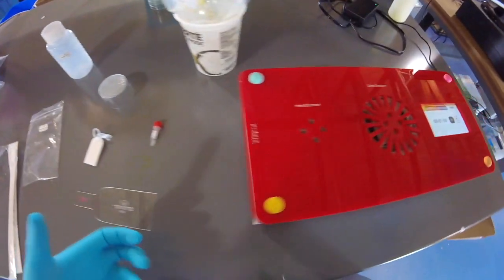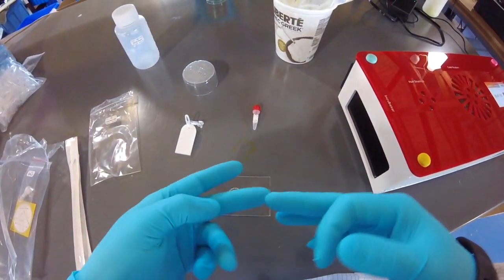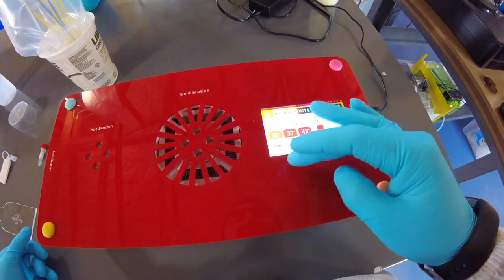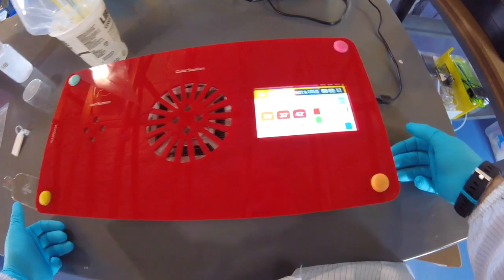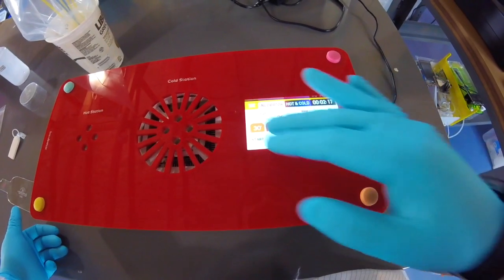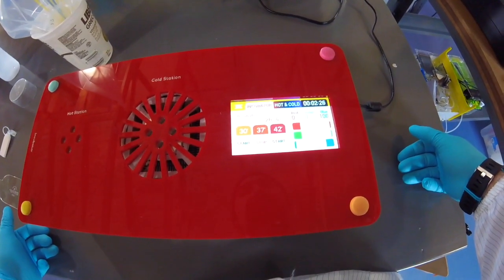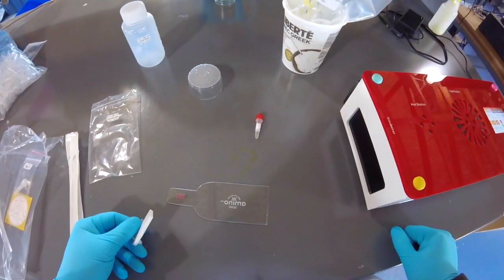If you're growing these on a weekend, like let's say it's Friday now, and you're not going to be back till Monday, so that's 24, 48, 72 hours, you could leave it at 37, but you can also grow them at 30 degrees if it's for longer periods of time. So 48 hours is recommended because the plates still do dry out. If you're doing 72 hours or even more, I'd recommend that you just have them grow at 30. They'll still continue to grow and divide, but importantly, the plates will not dry out at that temperature, because if the plates dry out, the cells are toast. Okay? All right, so we'll leave it at that for now.